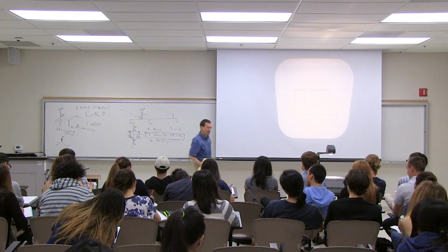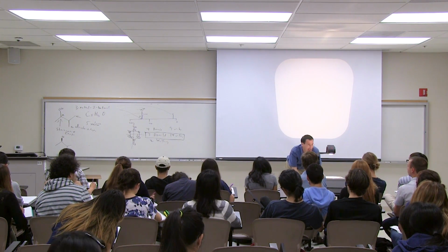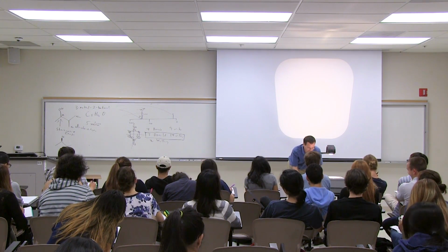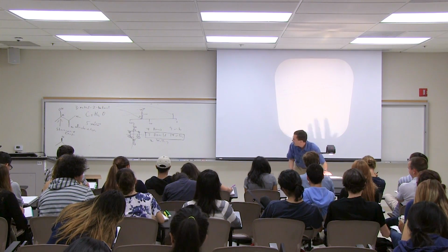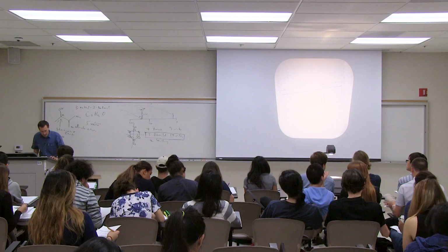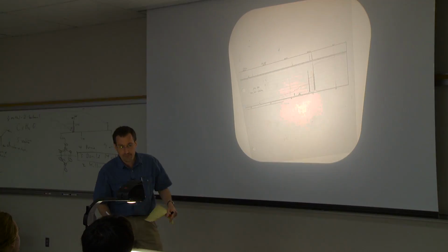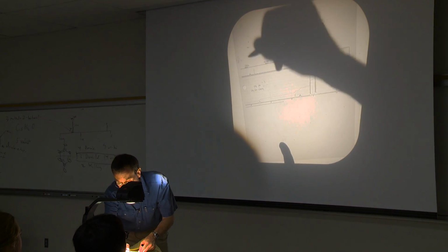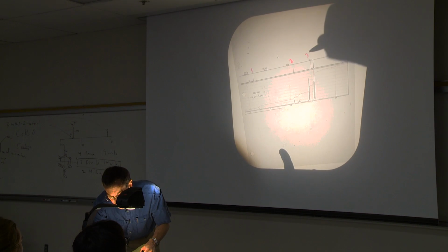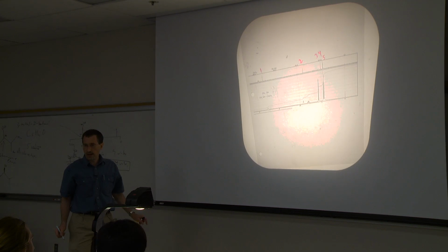I've asked that question to a room full of organic chemists, professors, and more than half of them got it wrong. So it's very easy to get fooled on stereochemistry. And just to demonstrate it as a point of fact, in your handout packets, sure enough, I grabbed again from Aldrich the spectrum, and we see 1, 2, 3, 4, 5 lines in the C13 NMR spectrum.